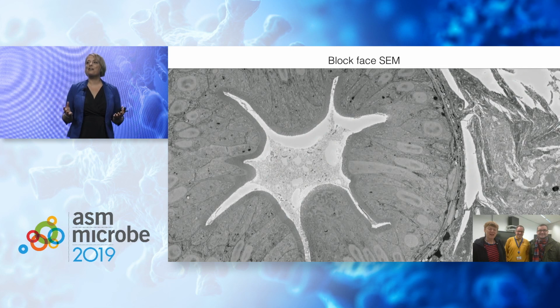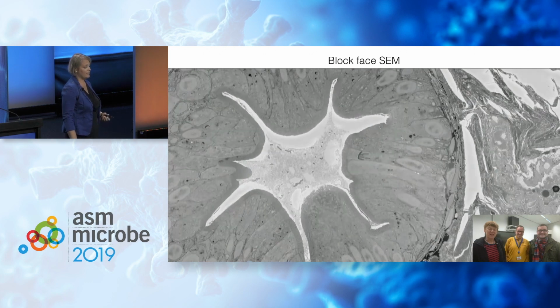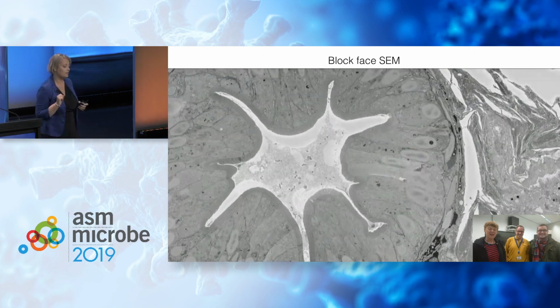We actually have a lot of these movies. We have run the microscope for 7 days straight. We have up to 650 micrometer blocks that we have now to analyze, so I don't have the full analysis, but I want to show you how this looks like. It's just a small segment.